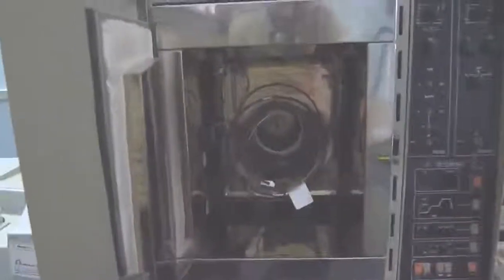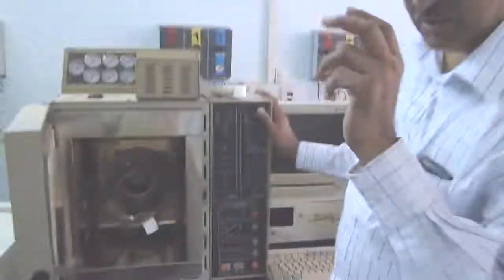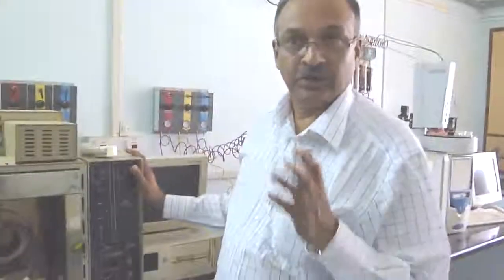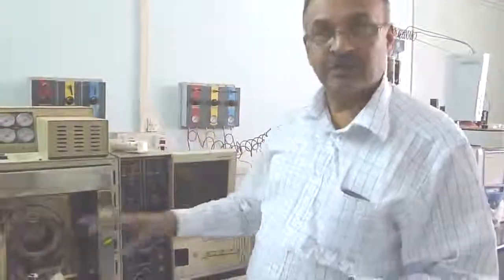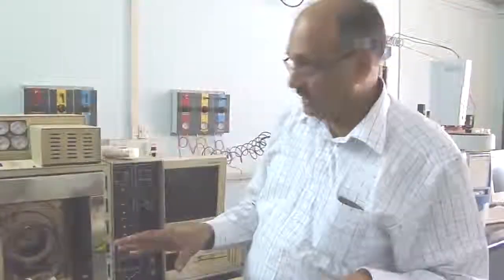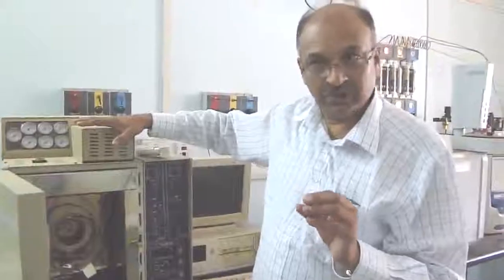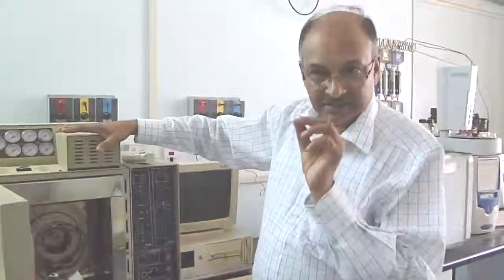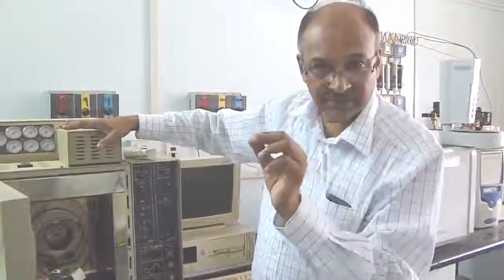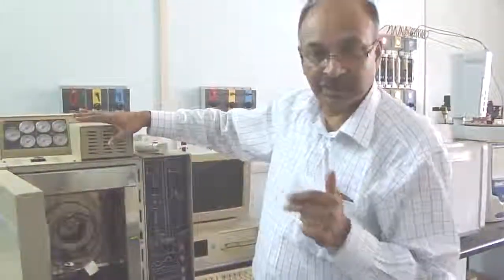The column depends upon what is your product or the residue in question — whether it is a gas or a pesticide residue. Likewise, we have different columns. Another important part of the gas chromatograph is the detector, which is very specific for the type of residues to be analyzed.